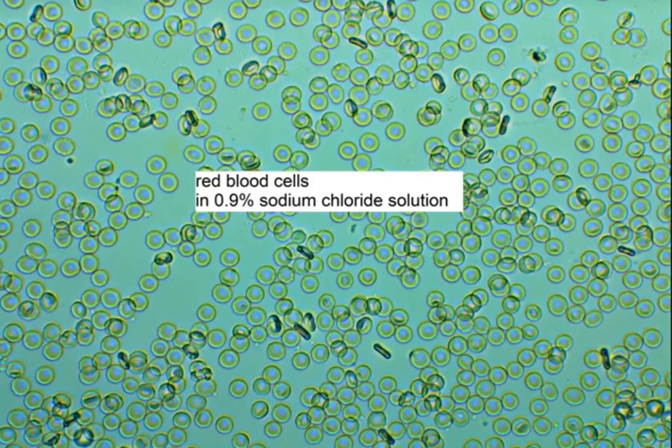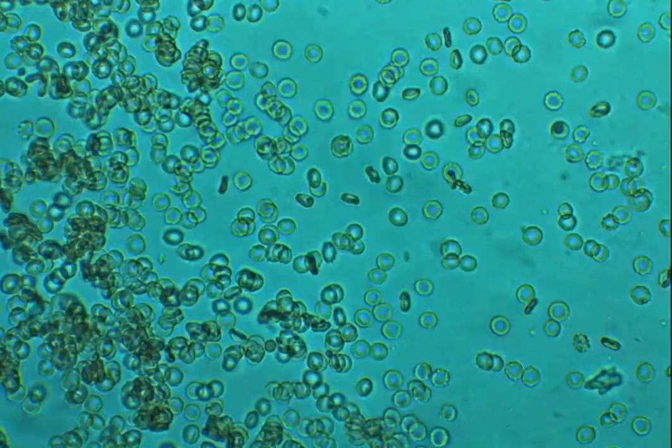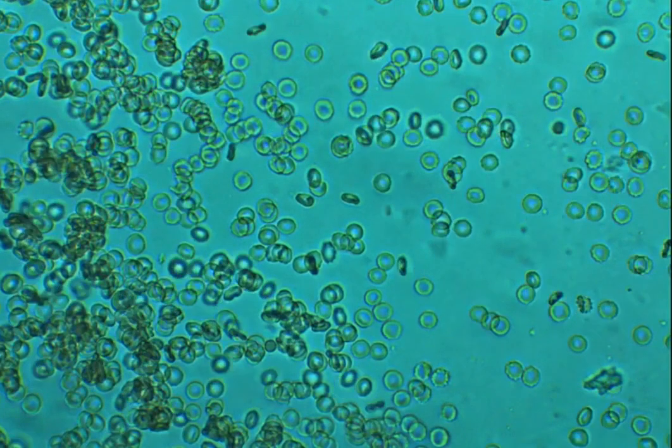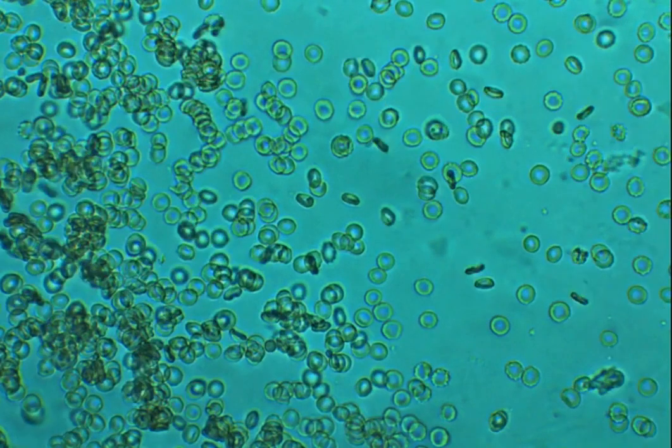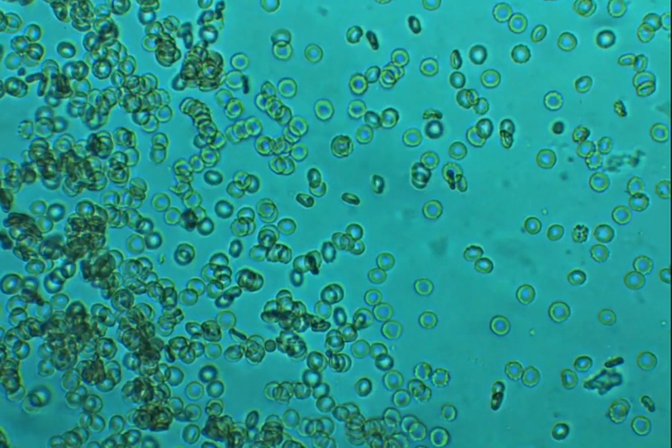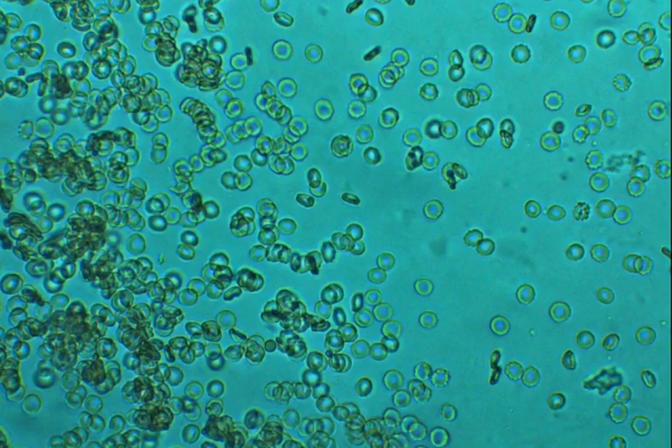What can you say about the morphology of our red blood cells? What is the shape? This is another view, still your 0.9% sodium chloride solution.